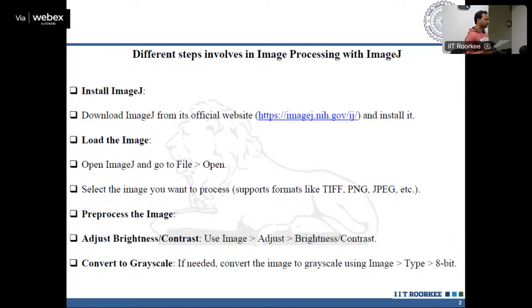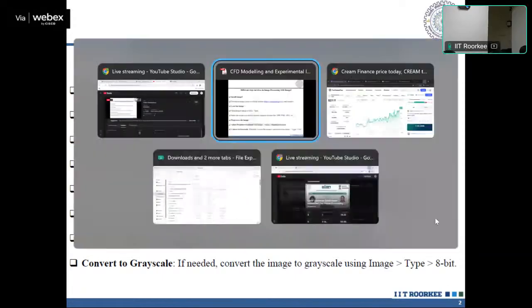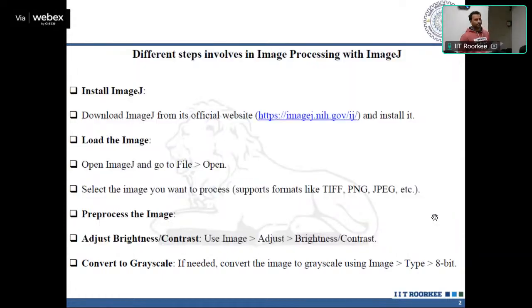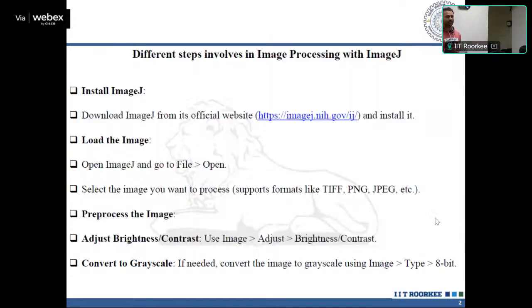So you can see images. Open one of the images from the Gyan folder in the image software, and then you can see there are 4 lines. So we know the outer diameter of the tube, that is 7 mm.